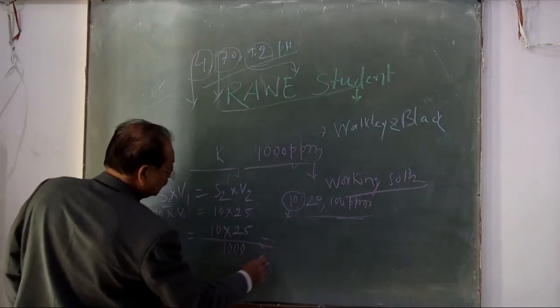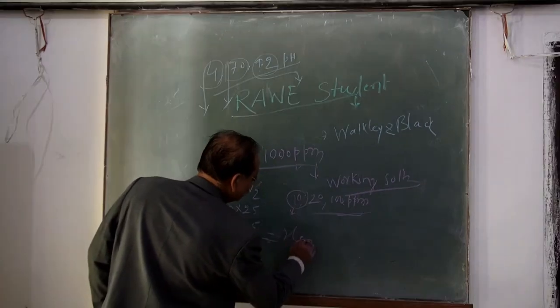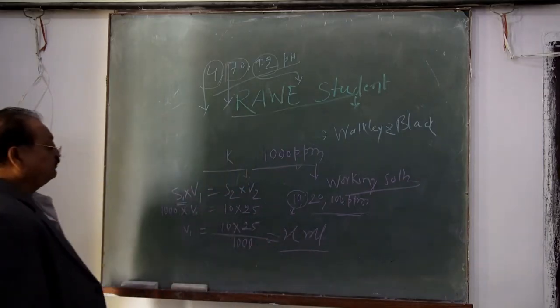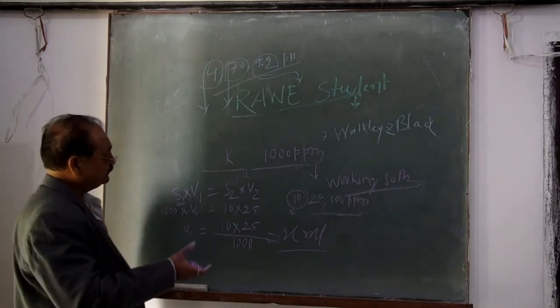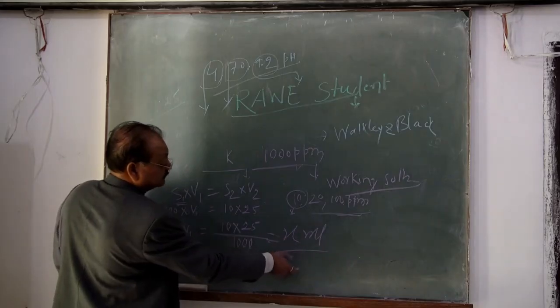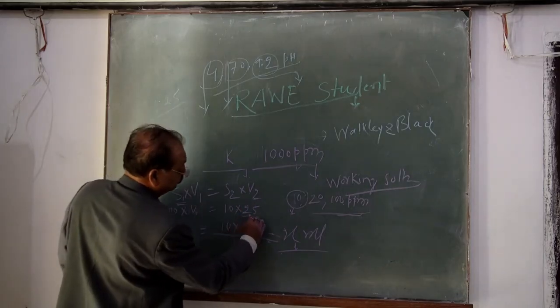Whatever value comes, you pipette that volume.